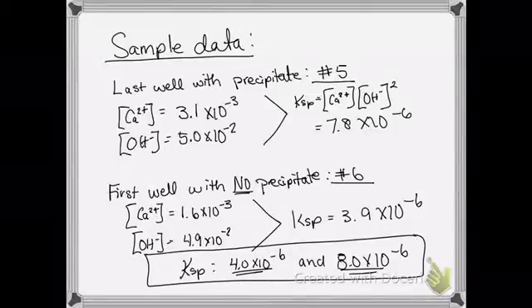So you would have to zero in on maybe a serial dilution, if you will, that would zero in on some areas in between these concentrations that you have here and here. So that takes some critical thinking, and it takes some time to decide on a good procedure that could get some concentrations that are between these.